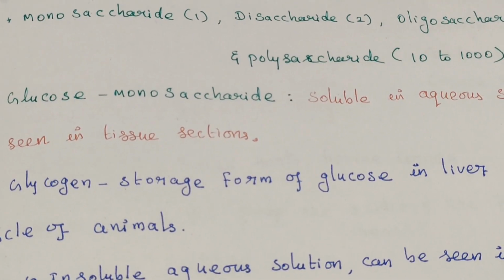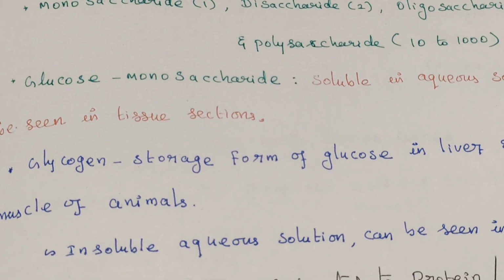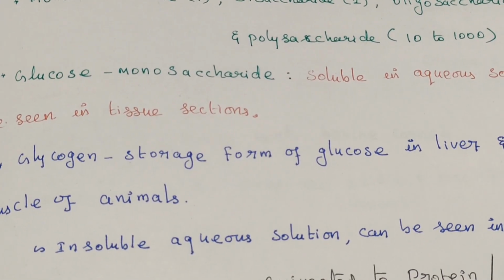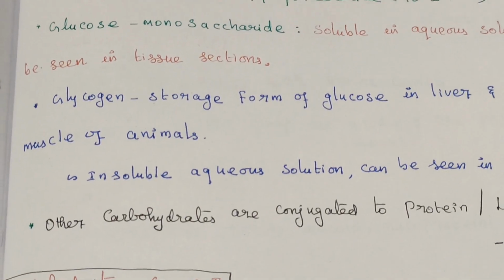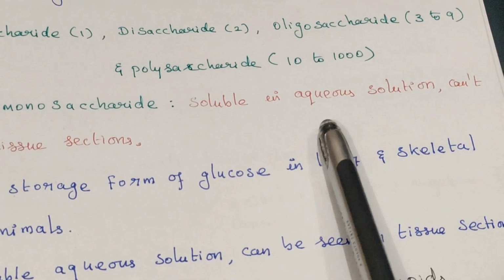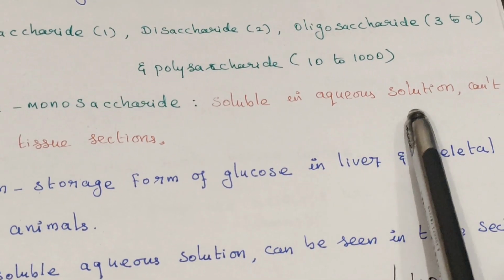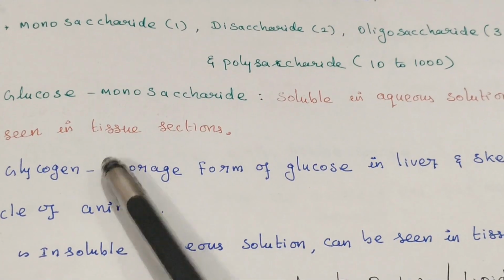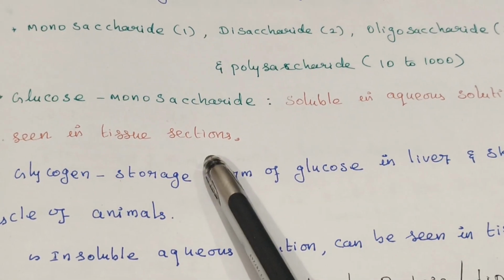It is soluble in aqueous solution, and because of this characteristic it cannot be seen in tissue sections.